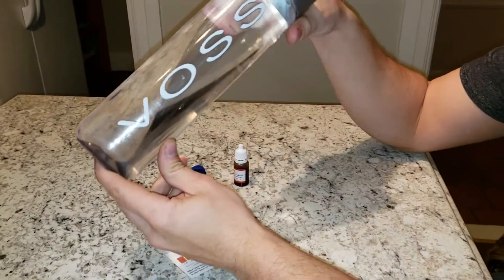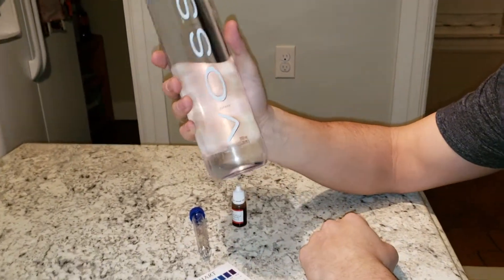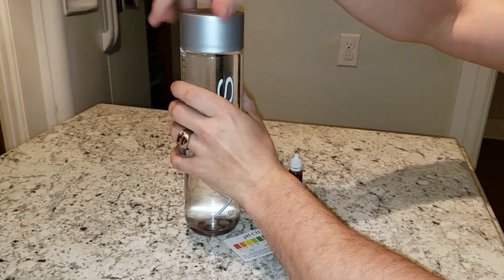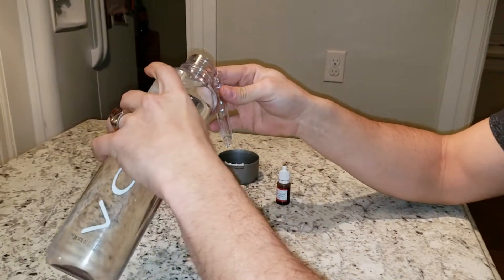Alright, back again with another pH test. This is for Voss — I'm guessing it's from Norway because it says it's from Norway. Artesian water, fancy bottle. It's going to be difficult to pour this in my test tube, but give it a shot.